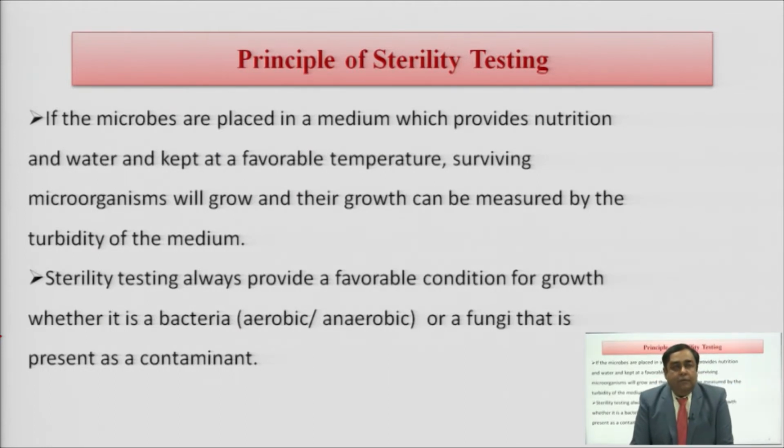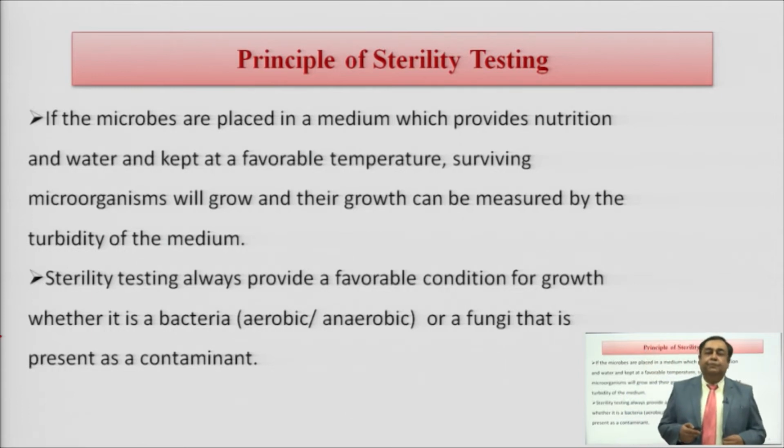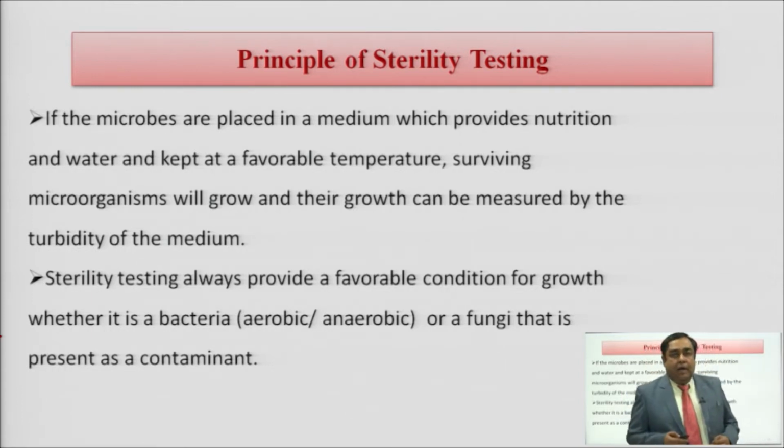Now, let us study what the principle of sterility testing is. If the microbes are present in a medium and this medium is providing nutrition and water kept at a favorable temperature, the surviving organisms will grow, and their growth will be measured or estimated by noting the turbidity of the medium.